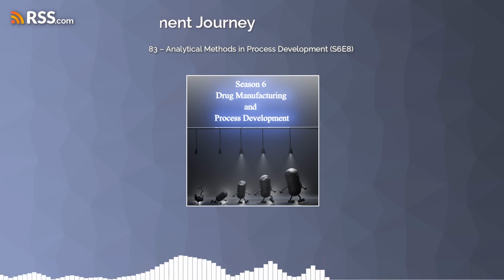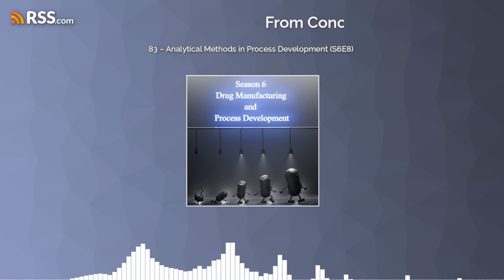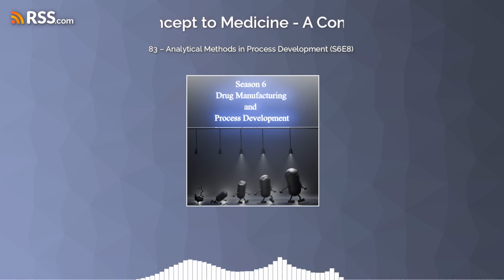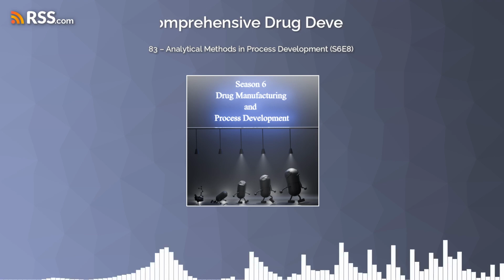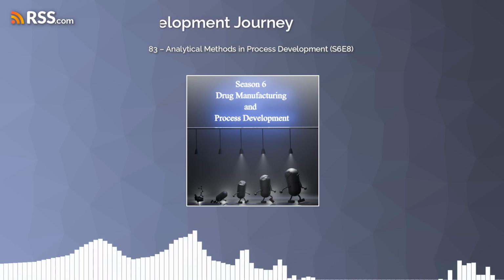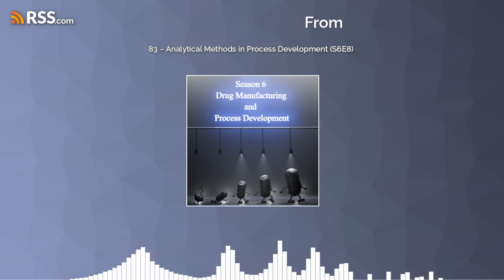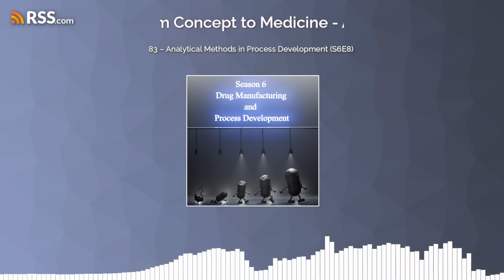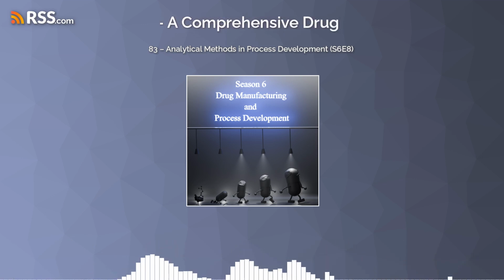Exactly. And then in OPR&D 2019G, which deals with purification of estrone triflate, they also highlight the use of HPLC to confirm that they achieved high purity, 99.1% after a silica gel chromatography step. So again, it's not just at the end. They're using it all along the way. Right. It's a continuous feedback loop guided by the analytical data. And what about OPR&D 2020B? Ah, yes. That one provides a great example of how analytical methods can be used to troubleshoot specific problems.